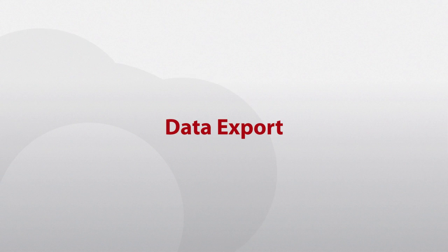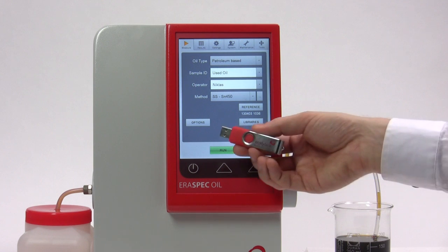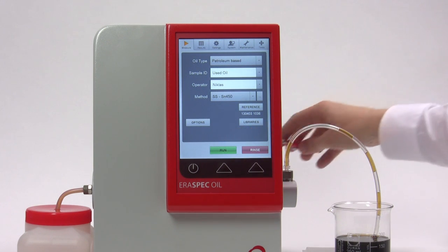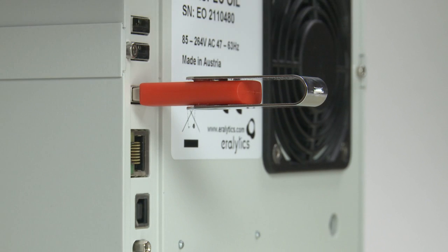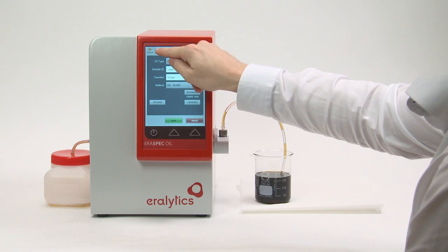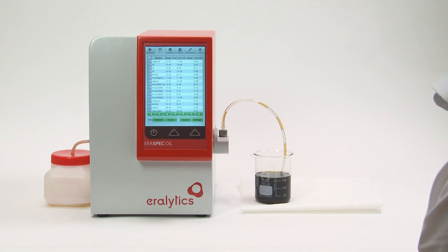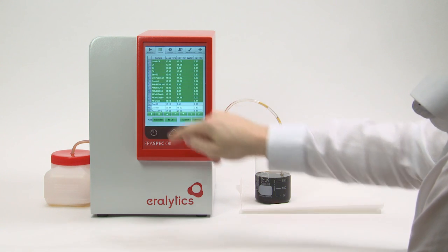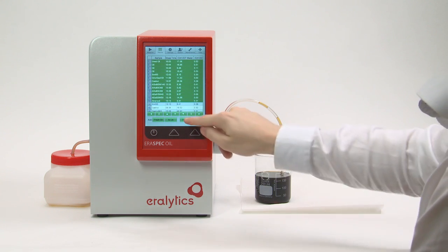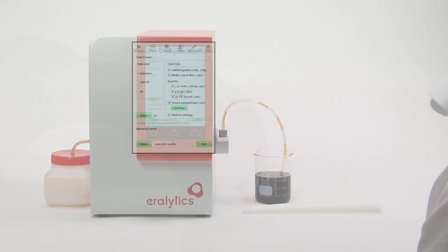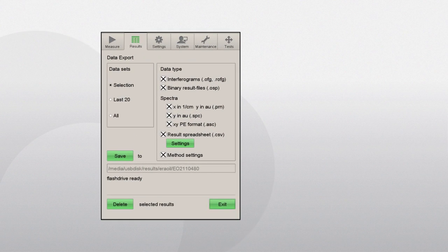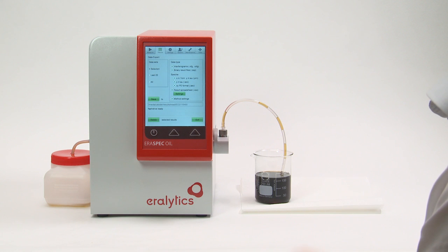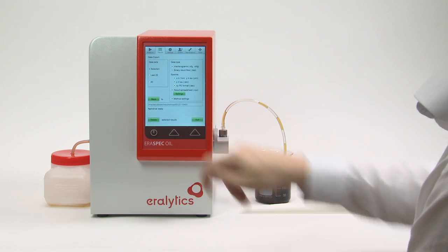Data export: the results from the measurement can be exported to a USB stick. Click on the Results tab to see the list of stored spectra, mark the spectra that shall be exported, and click Export. By default, all ASTM, JOAP, and DIN standards as well as the correlated parameters will be exported to the results spreadsheet. Press Save to save the results to the USB stick.